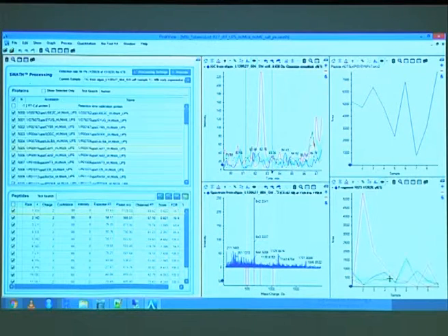It's like looking at a shotgun spectrum with a probability of say 0.1. It won't look that great. So in this case, in the library, it's the UPS standard, a standard mixture of human proteins. They were not present, so we can just pick one.